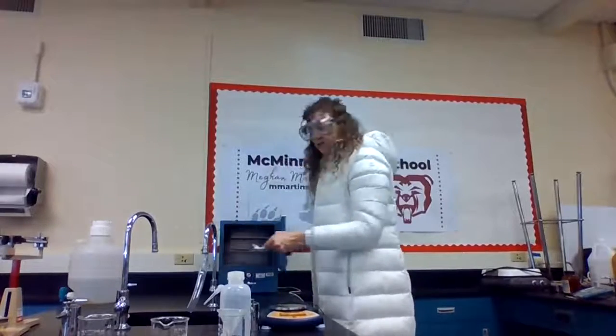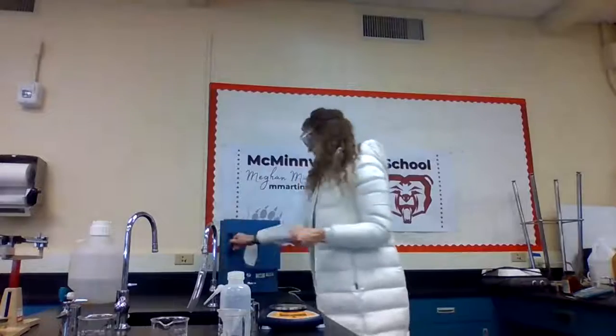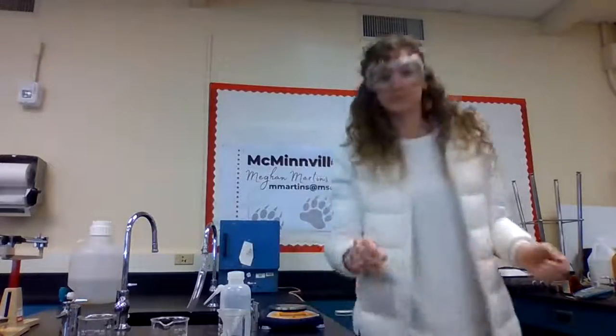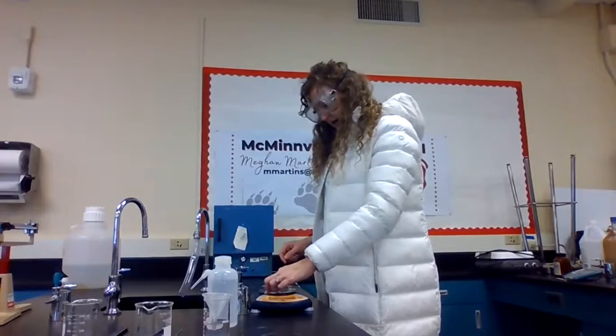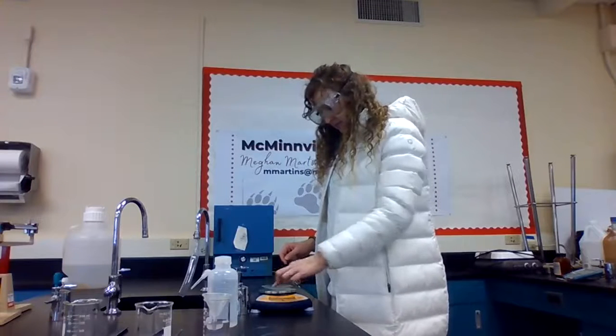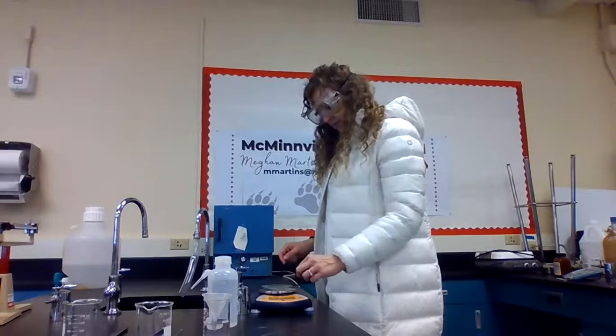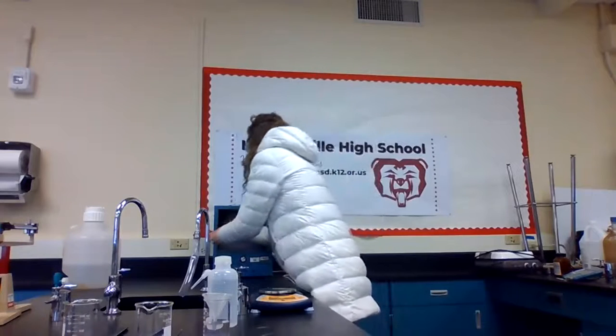All right, let's put it back in for another 10 minutes. Okay, third check. Let's zero our cool watch glass. Collect our filter paper.